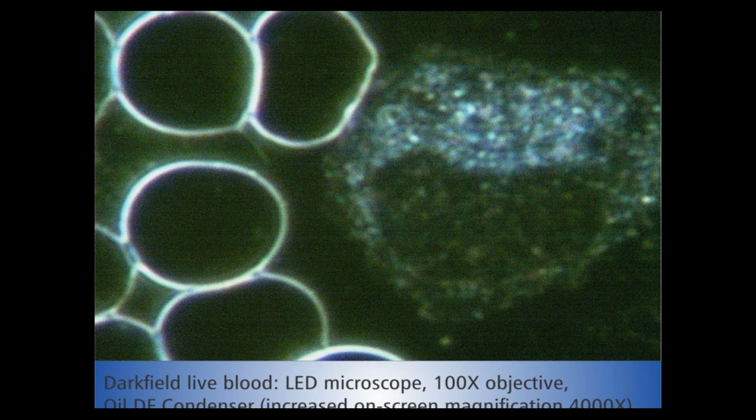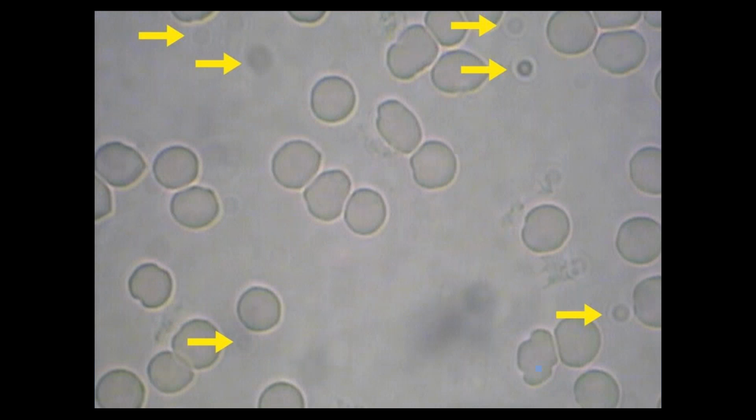Now the manufacturers and suppliers of these cameras are usually quite shocked when they see this, because when the camera is used normally, there are of course not any spots visible. So I had to look through some of my old images here to find an example of what these spots would look like. Now this is a live blood image in bright field where some of the spots are visible. You can see quite a large number of them. You can see there's quite a few, but I've actually seen much worse than this.